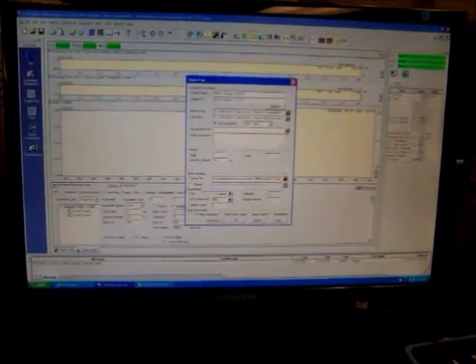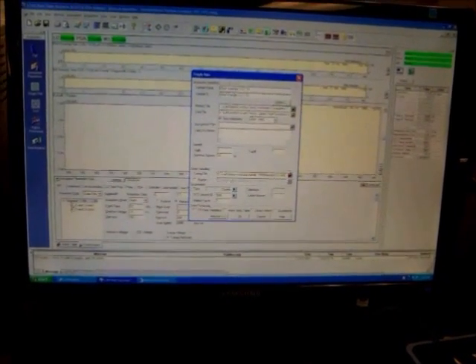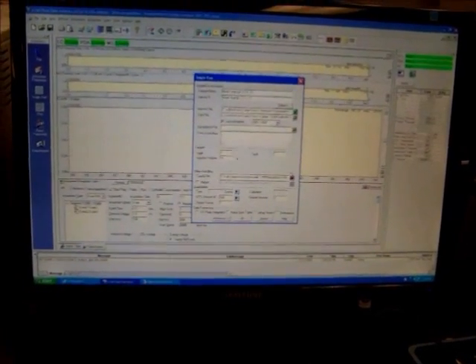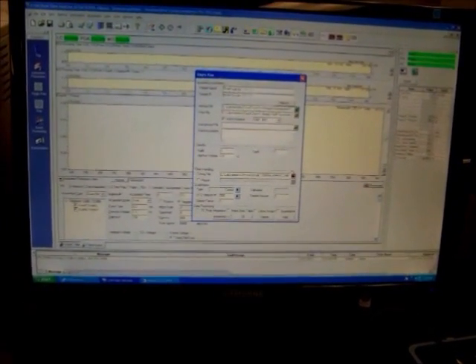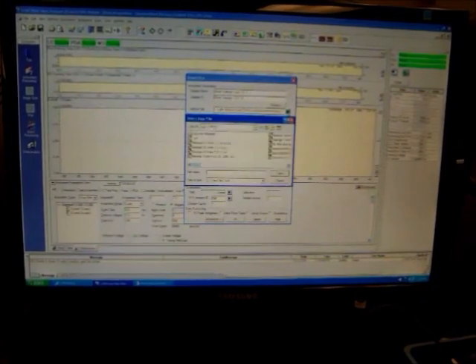Now again, the method files, we're going to see in different videos how you develop different method files. So for this case, we're just using one that I've already developed.